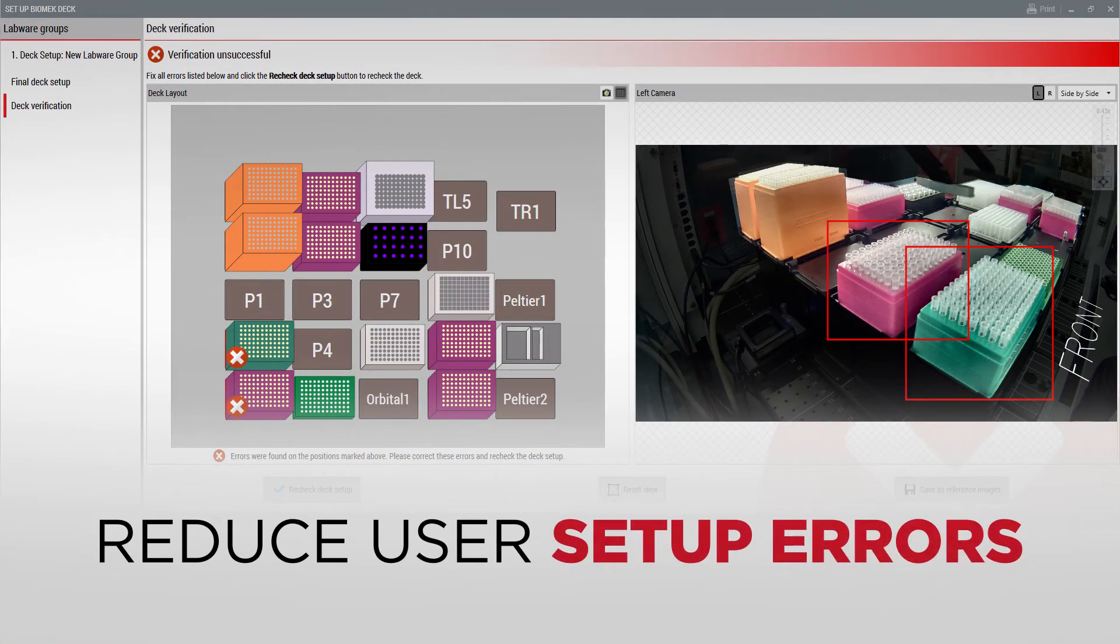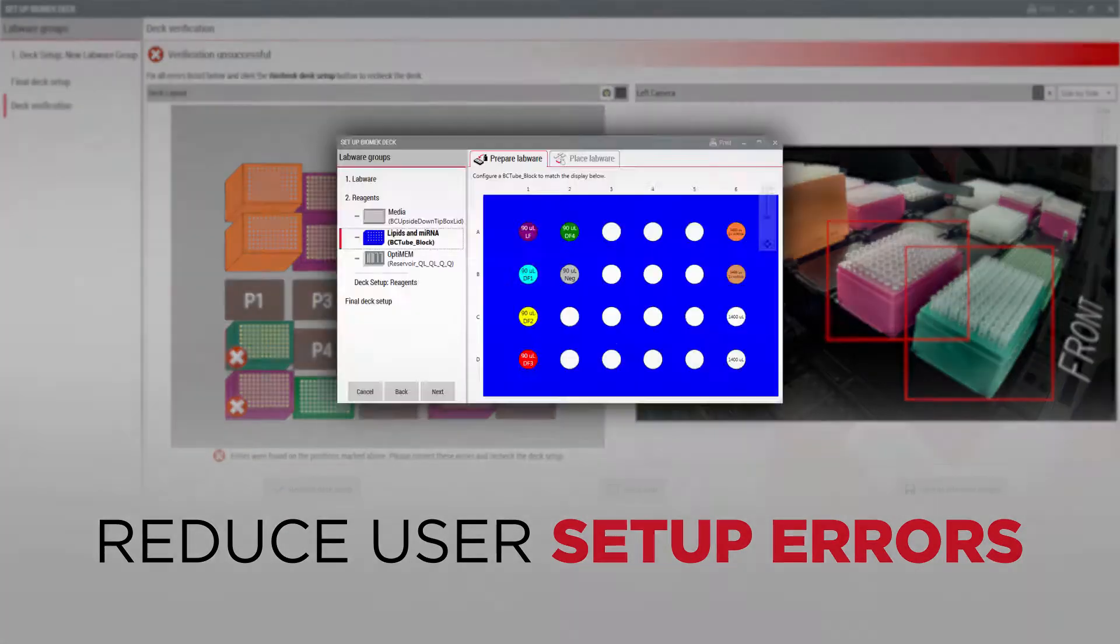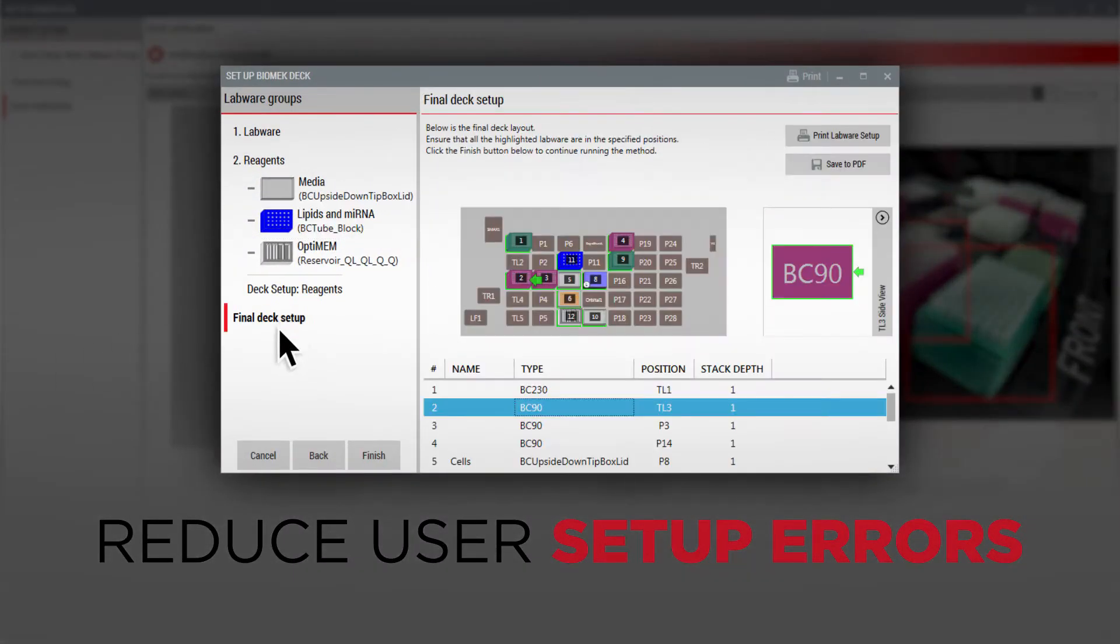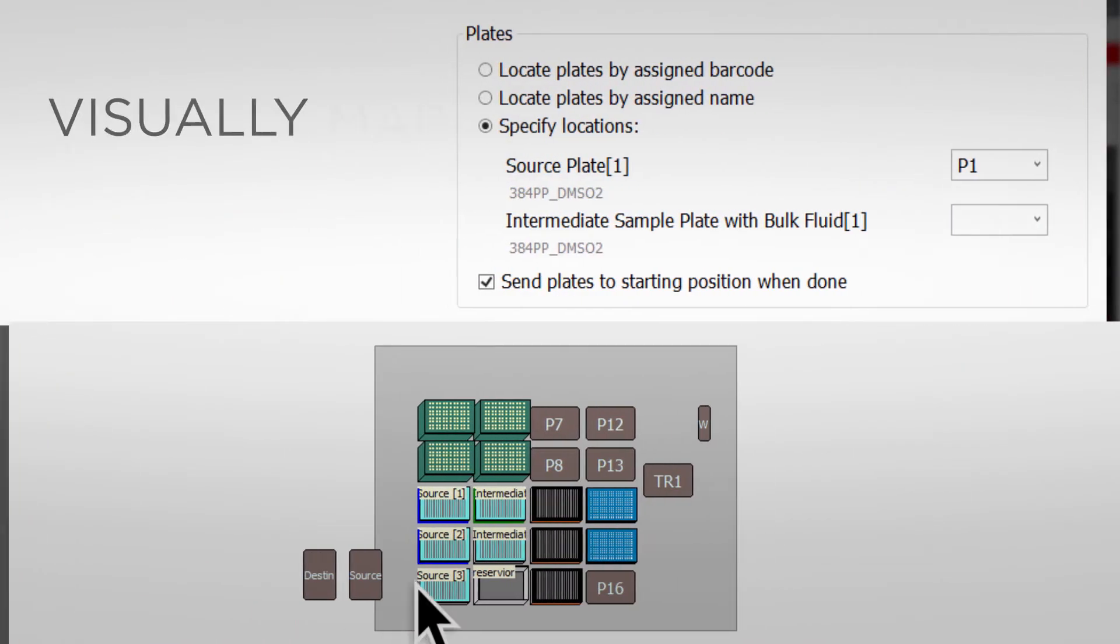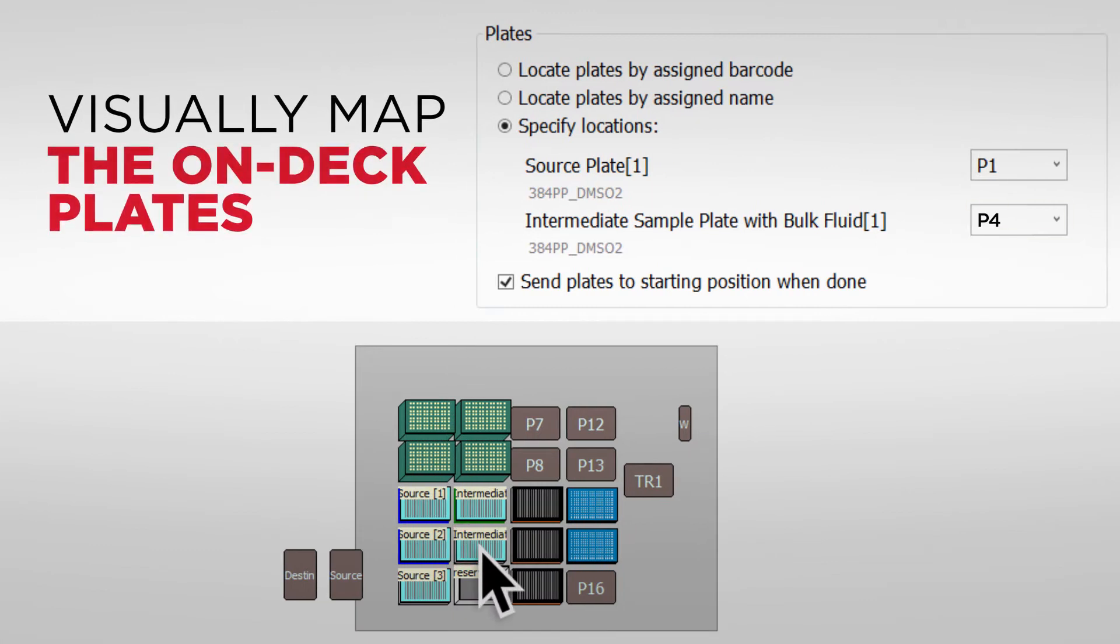Reduce user setup errors by starting runs using the guided labware setup and DeckOptics final check to visually verify the consumables on the deck, visually map the on-deck plates to the Echo, or allow the system to dynamically select the plates to load.